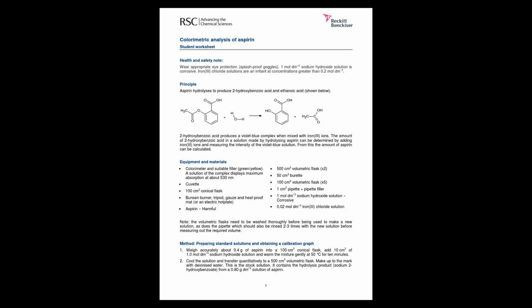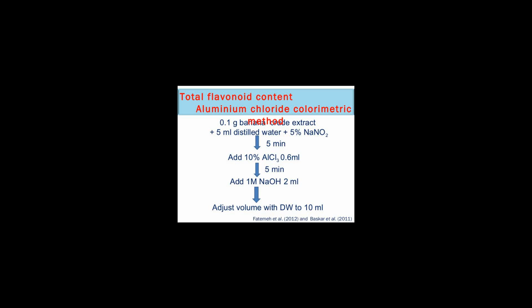See also: Blood sugar. MBAS assay, an assay that indicates anionic surfactants in water with a bluing reaction. Nessler cylinder.